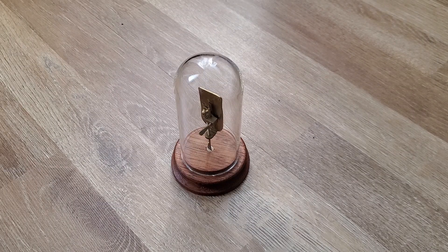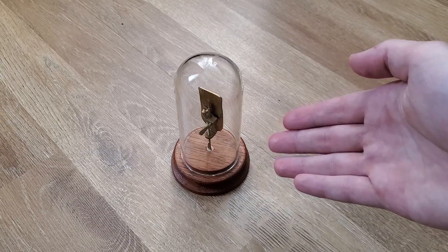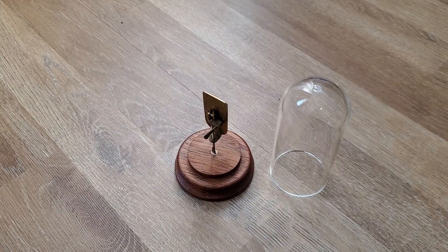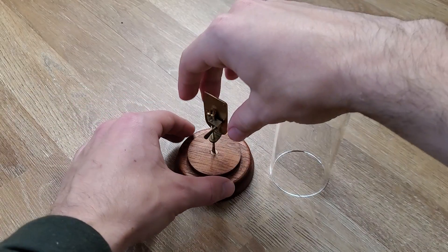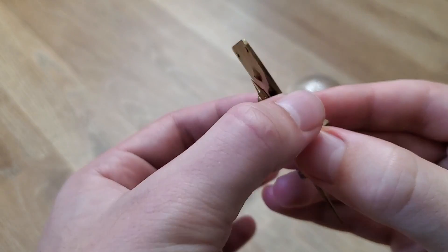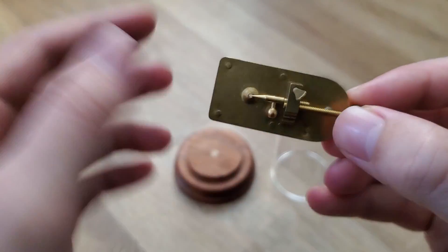Hey QCamers, today I wanted to show off the replica von Leonhug microscope that I recently got. If we take the microscope out of its display case, we can get a closer look at this interesting instrument.